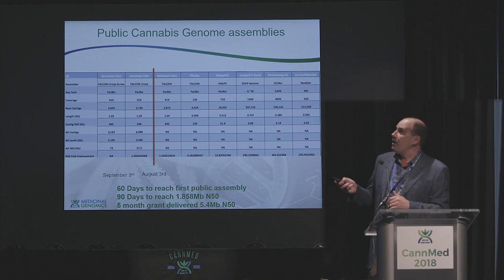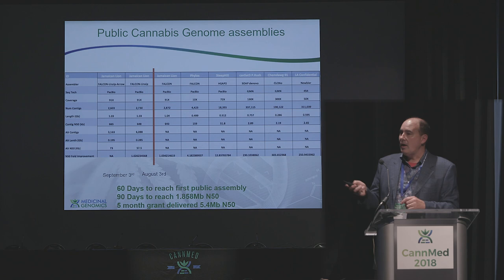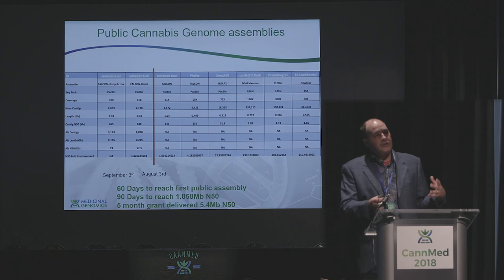And then many other people started chipping in. Steep Hill put out a really nice assembly that then bumped this number up. Likewise, Phylos put one in there, and I think the N50 number got up to 159 kb. That was the longest, most contiguous assembly, and it was on Canatonic, which was a type 3 strain. So we weren't getting much information out of the THC genetics from that strain, but it was still giving us great insight into maybe the CBD genetics.